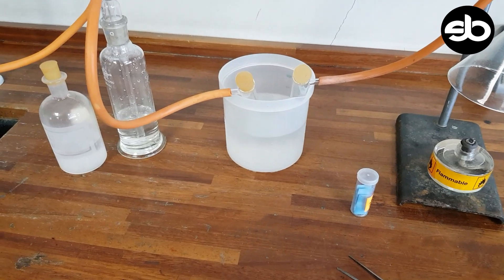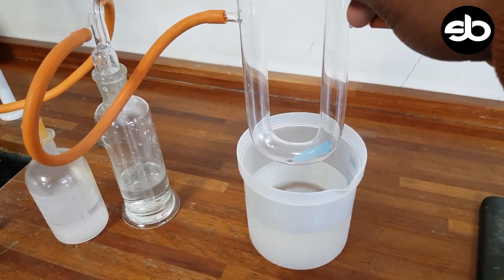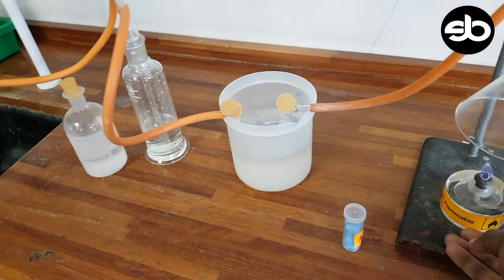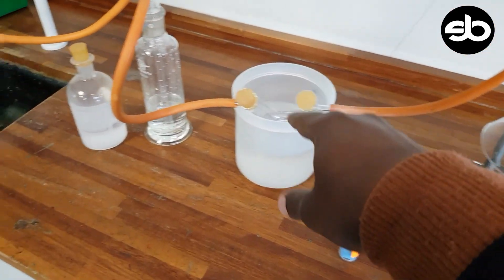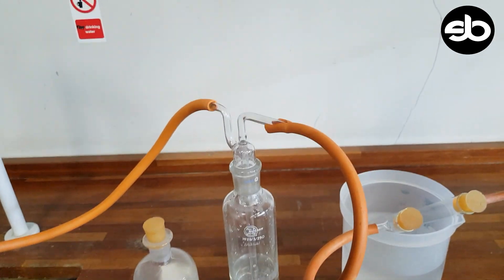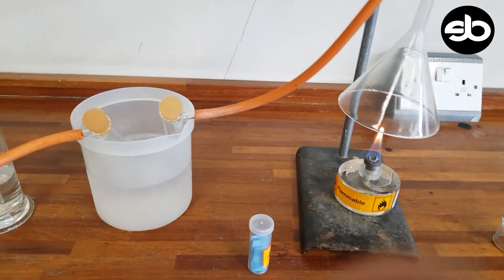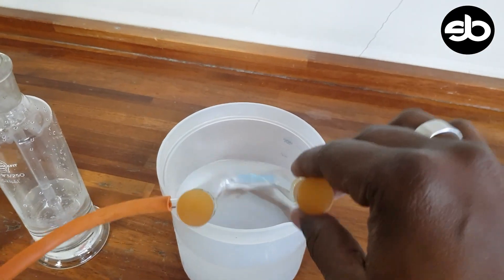I've just put the cobalt chloride in there as you can see. It's blue in color. As the fuel burns, CO₂ and water come through, and our cobalt chloride paper is already changing color.